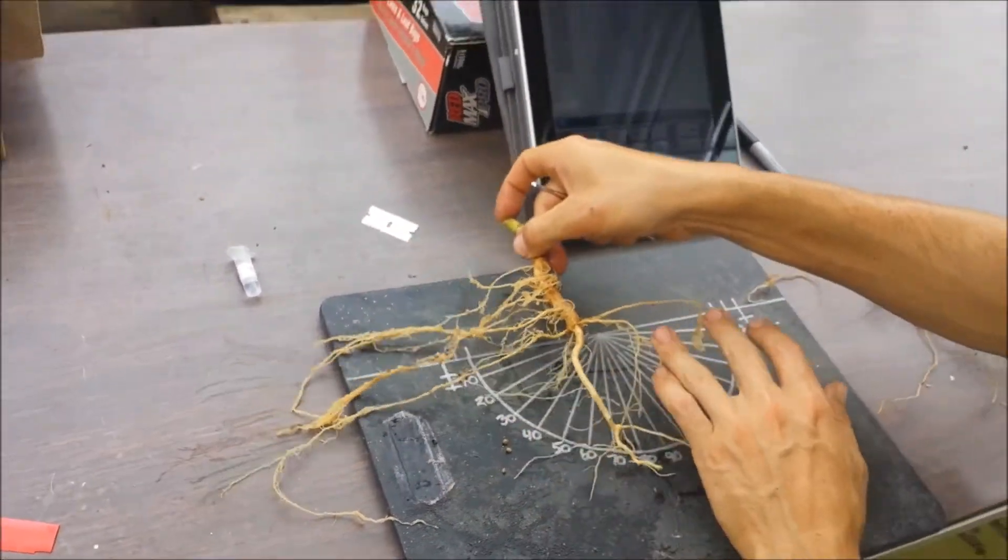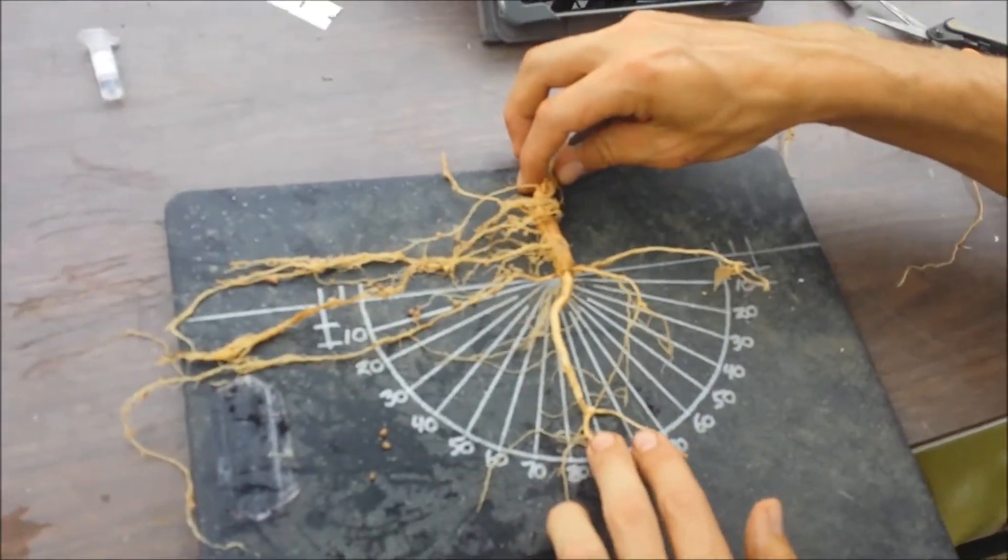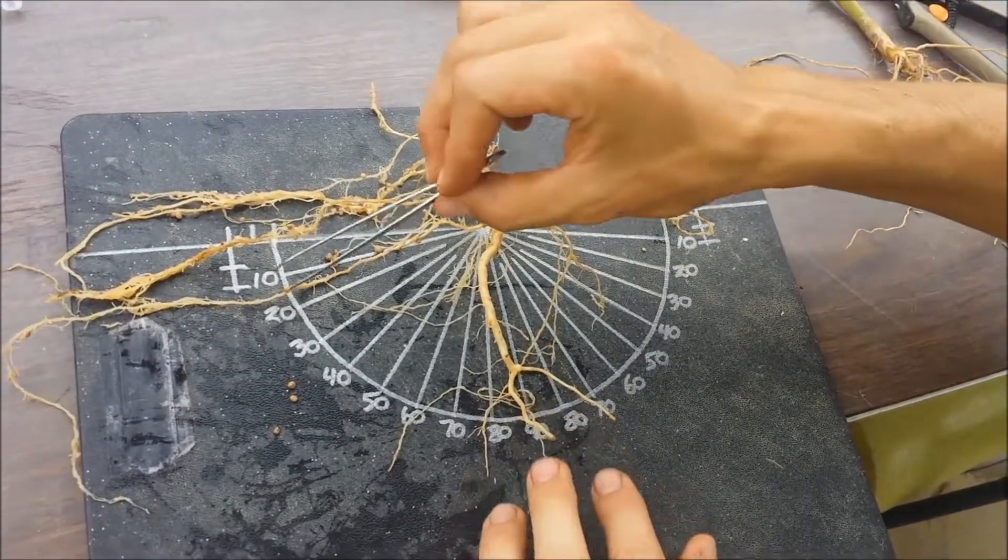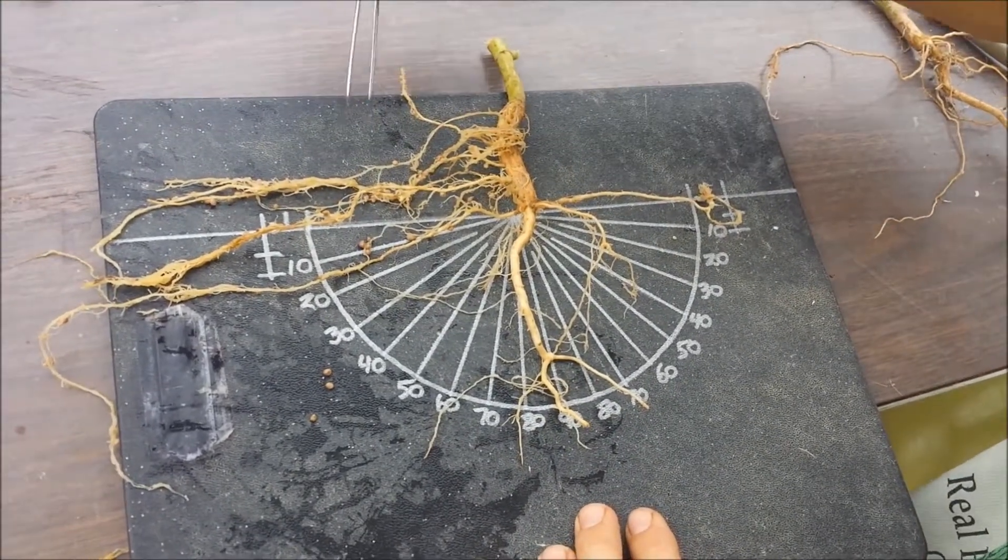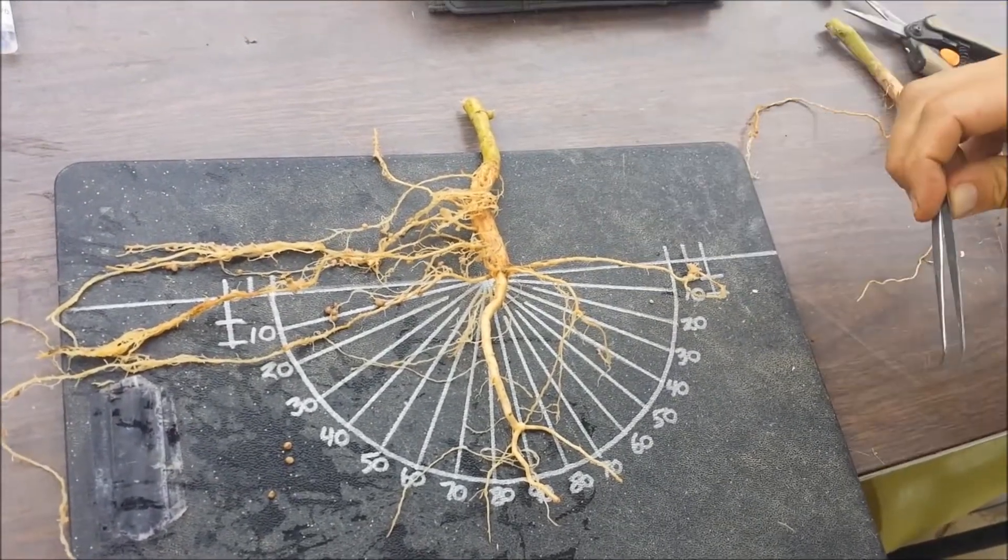Then I would look at angles. So I'd be interested in the angles of the basal roots. In this case, I'm looking at where they cross this line, which is a 10 centimeter arc. This one is fairly shallow, so I would score this one between 10 and 20 degrees from horizontal.